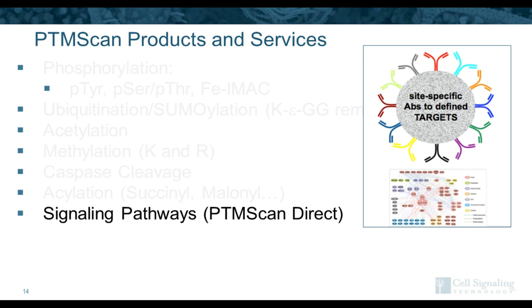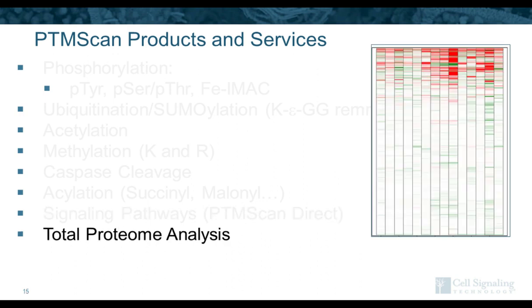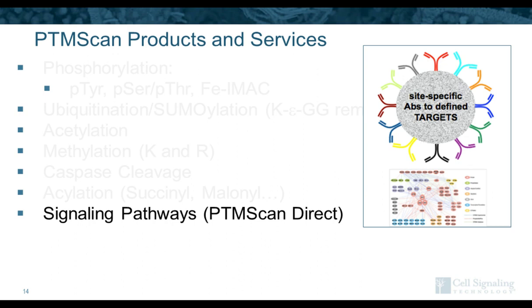And now we can actually look at signaling pathways. So here the method is the same. You cut to peptides, do an antibody enrichment, and run the mass spec. The only difference are the antibodies that we're using. So instead of using, say, a phosphotyrosine antibody or an acetyl-lysine antibody, what we've actually done is made multiplex cocktails of our site-specific antibodies. And we've designed those cocktails to interrogate specific signaling pathways or protein types like kinases.